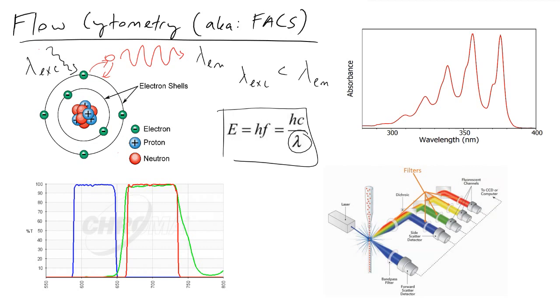And so what this tells us when we look at a particular plot, and if we were to consider a fluorophore like Cy5, is that we're going to see that Cy5 has a particular band of photons that will excite it. And so when we are looking at this, we can now label this plot that I have in the bottom left here as an excitation band or range. I'll just call this an excitation band.